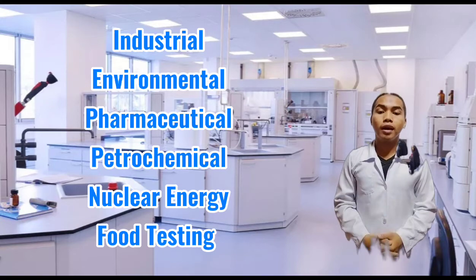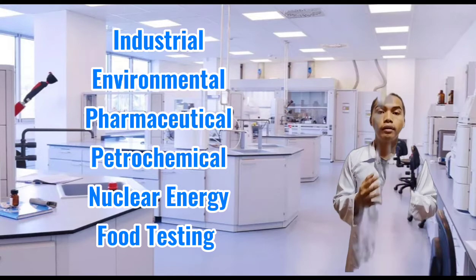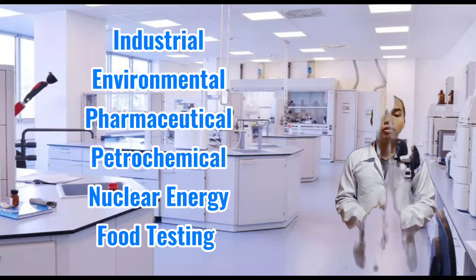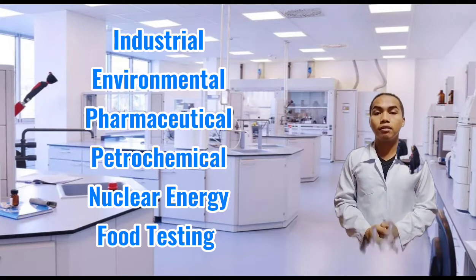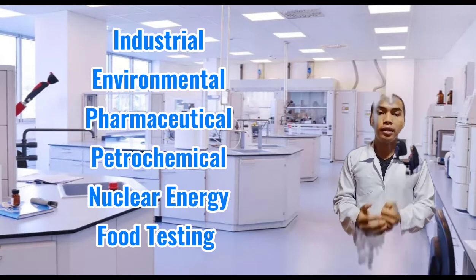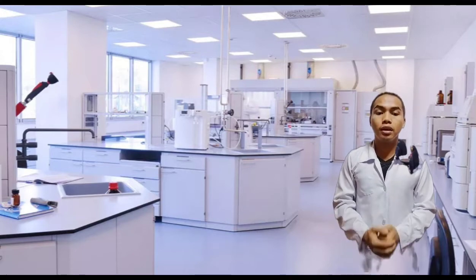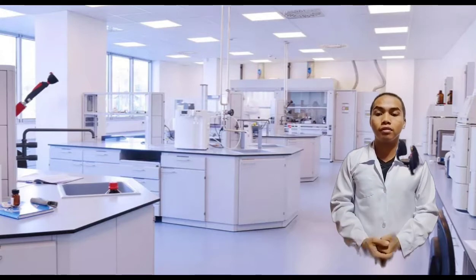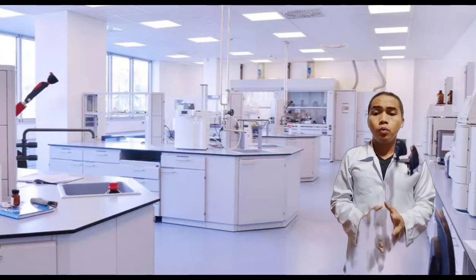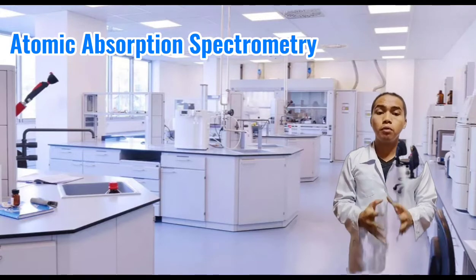In environmental science, it could monitor metal pollutants in soil and water. The pharmaceutical industry uses these machines to determine if a metal catalyst remains after a drug has been purified. And lastly, the mining industry would utilize these devices to detect the quantity and presence of precious metals like gold or silver. In atomic spectroscopy, we have what we call the atomic absorption spectrometer.